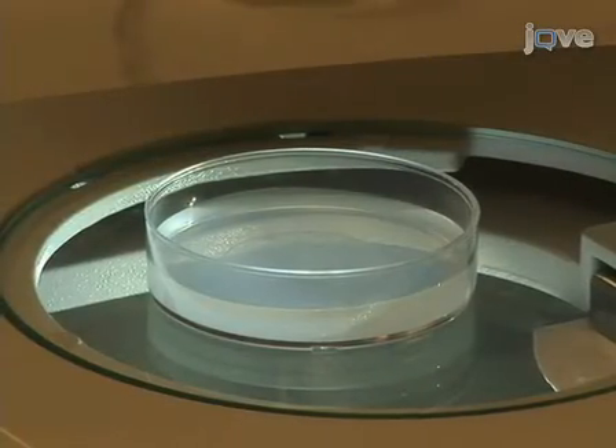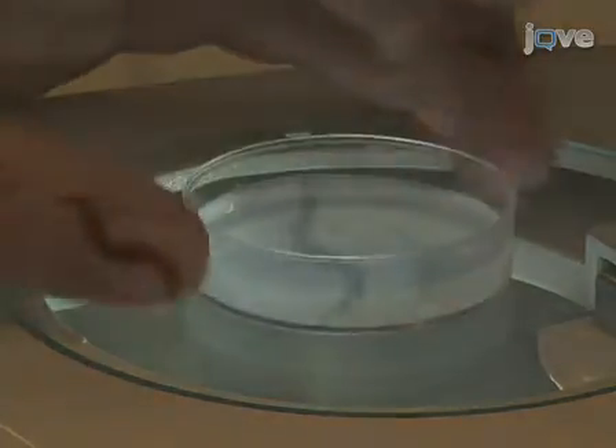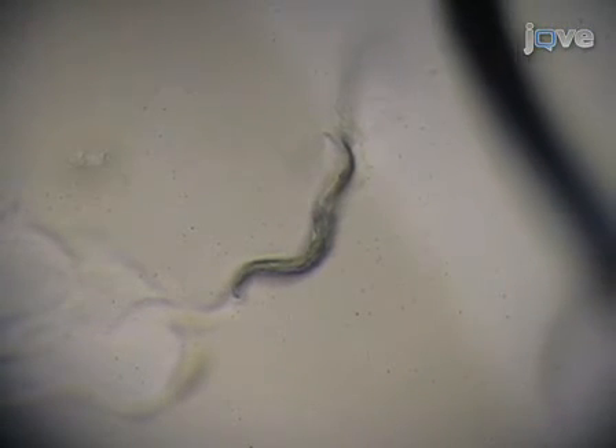Score all worms for lifespan every two to three days. Using a dissection scope, determine whether each worm is alive or dead. Gently tap the plate — the worm is alive if it moves in response to the tapping. If the worm does not respond to tapping the plate, zoom in on the head region. Gently tap the worm's head with a platinum transfer pick. Score the worm as dead if it does not respond by moving its head. Remove the dead worm from the plate. After checking all the worms, record the date and the number of worms that are alive and dead.